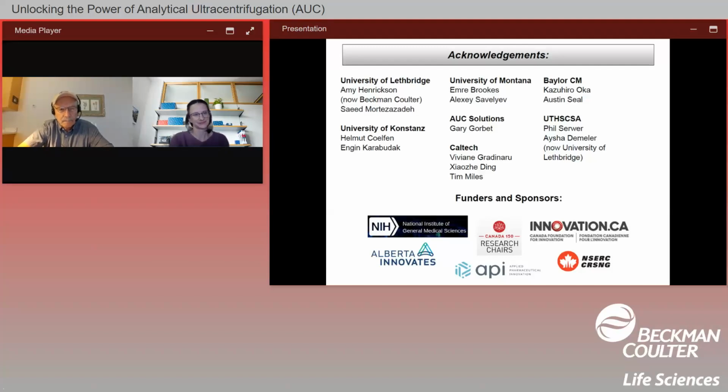advantage of AUC. And then in addition, I would say that sample requirements are generally low enough that you can pretty much measure any molecule of interest using AUC without great expense, and you can obtain probably more information with AUC than pretty much any other technique out there, at least on the macro scale, right?